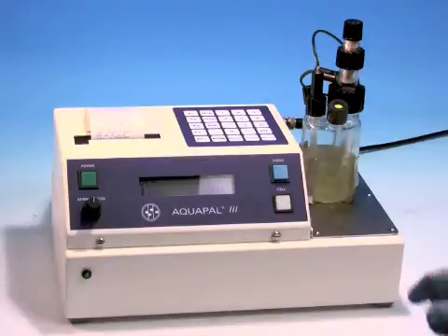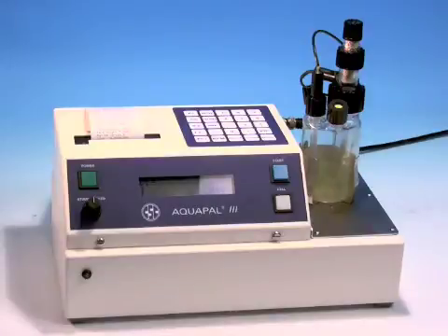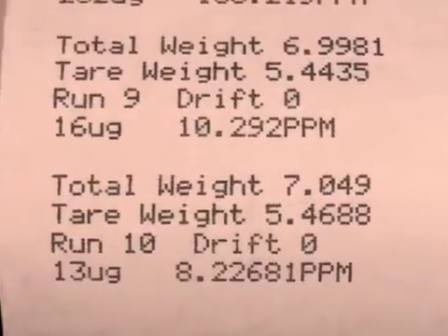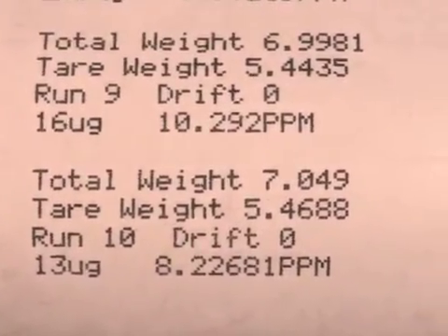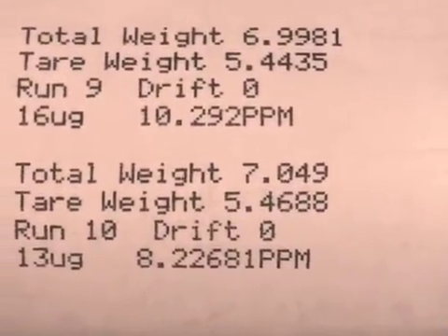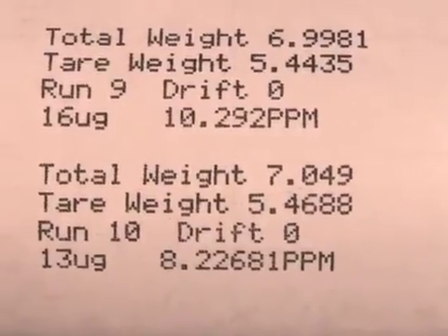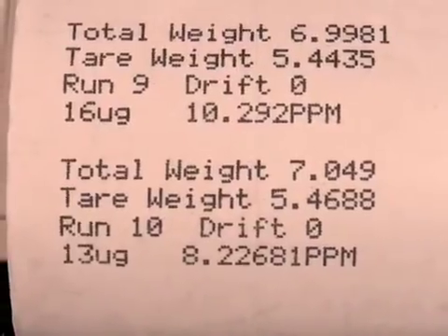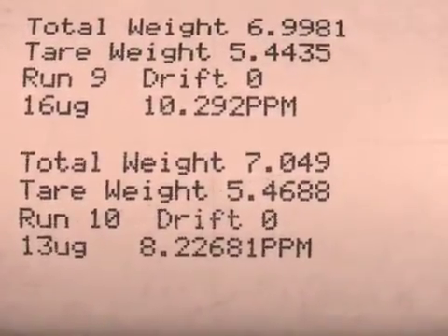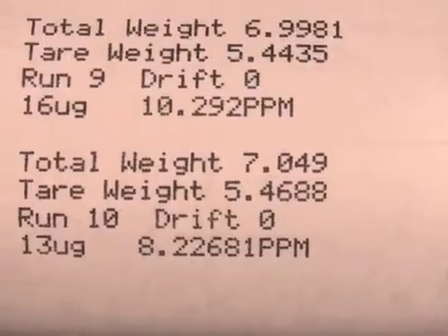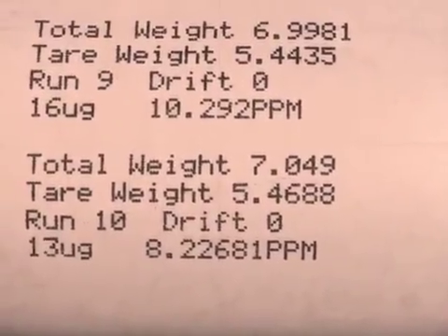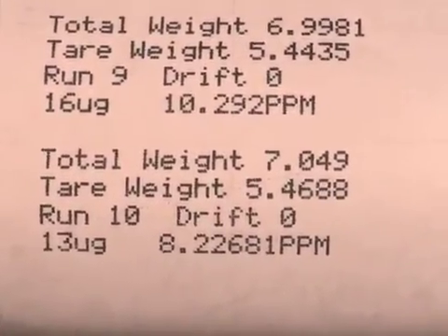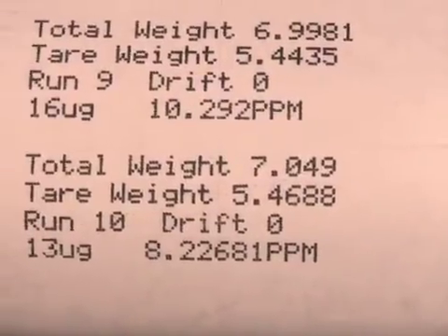It looks like this standard is working well and the Aquapal single reagent is really measuring this well. I can even zoom in on that result. You can see from these two tests, the first test I was at 10.2, then I ran the second at 8.2, and if I ran more I would probably stay under 10 ppm, but it's a nice check to make sure I'm getting my low-level ppm. This is the Aquapal 3 with a single reagent generator electrode, and these are the results using this standard.